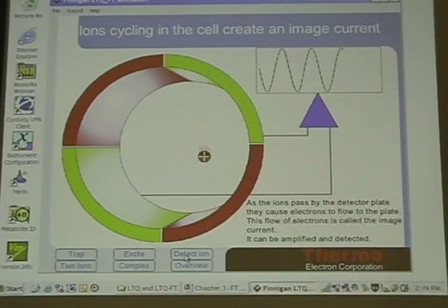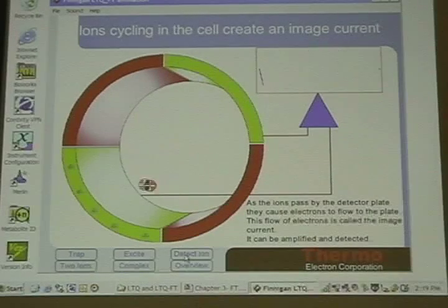So it's a choice you make as a researcher. Do I want more? And it's not sensitivity you're gaining. It's dynamic range you're gaining. You're gaining the fact that if a complex mixture is eluting, what's the highest ratio I can get between the tallest peak and the smallest peak? That's the key. It's dynamic range. People keep using the word sensitivity. That's the wrong word. It's dynamic range.